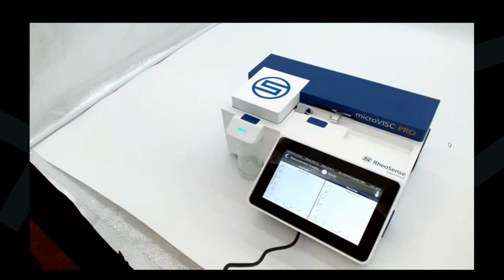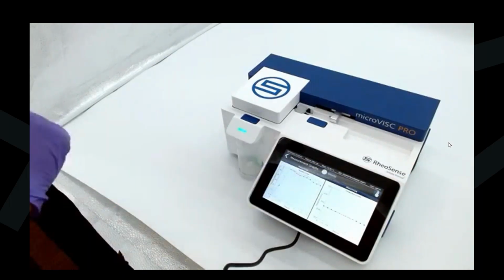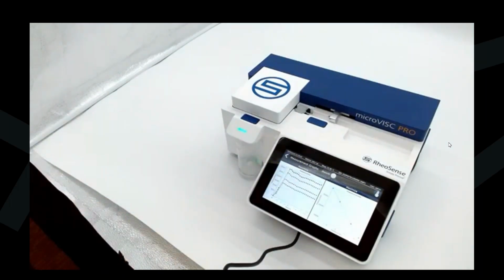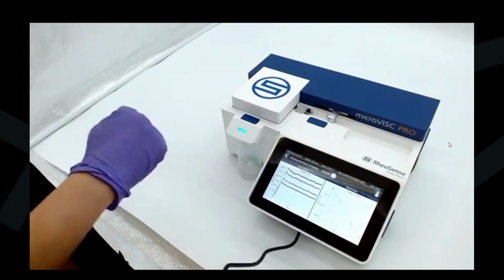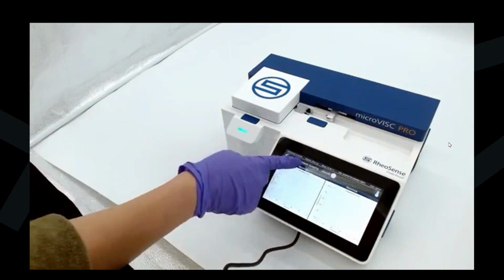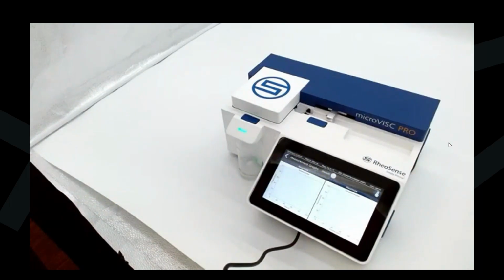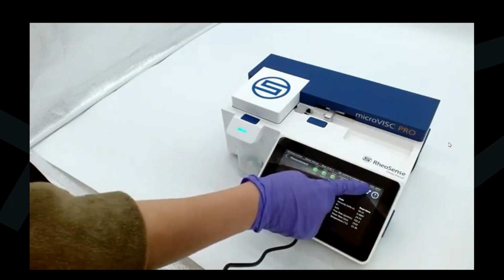Here, if we select the viscosity tab on top, we can see the pore pressure sensors versus time. We can see the linear pressure drop that's characteristic of this microfluidic geometry. It's very linear, showing very good quality data. Here we can see the data is very good, the viscosity versus time is excellent. And again, we can see the nice linear pressure drop for the data.